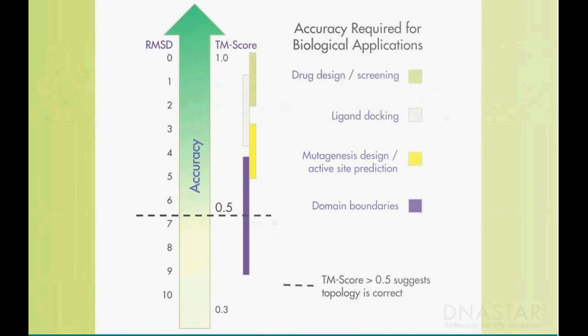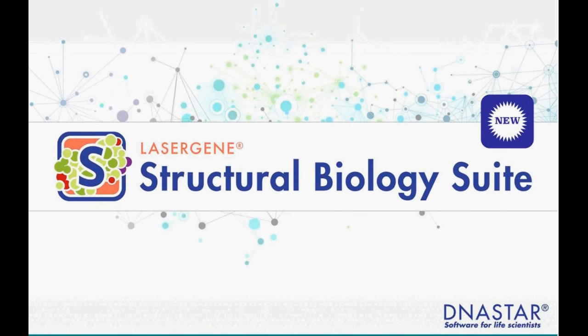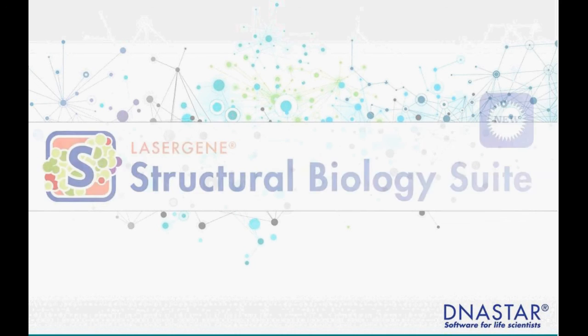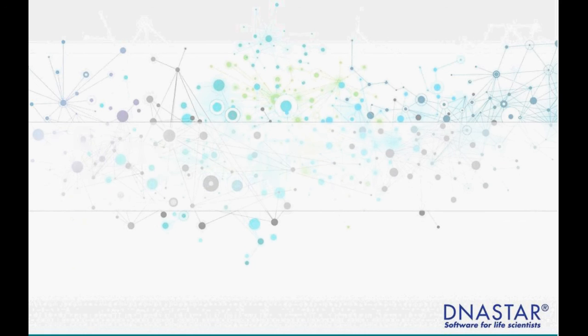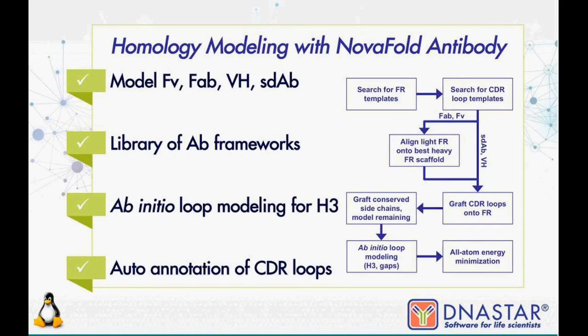So now that we've gone through how to access the power behind NovaFold and the results themselves, I just wanted to give you a brief glimpse into the new Nova apps that were added to the LaserGene Structural Biology suite. The first is NovaFold Antibody. As I said before, it's the specific workflow designed for really the most popular set of proteins right now in terms of a lot of academic, government, and commercial research.